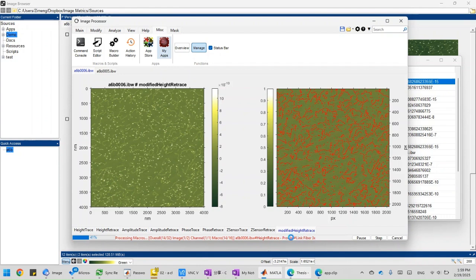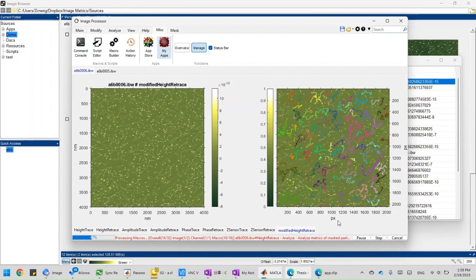And then we can link the protein fiber, the DNA fiber, if it's disconnected. Then apply the filters. Remember the filter parameters that we just set, right? The area and the intensity filter. That's how we get rid of this free protein and DNA, and identify our protein-DNA complex, which you can see here is labeled in different colors, and they are well connected. That's exactly what we want, and we are doing particle analysis.